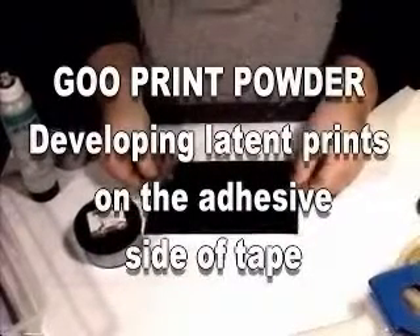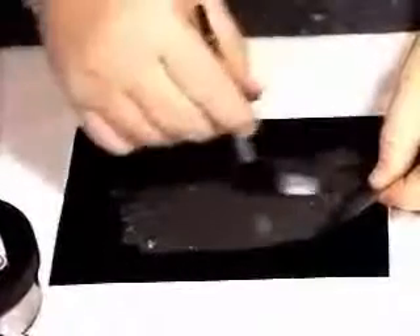When you have latent prints on the adhesive side of tape, a simple process is to use goo print powder. Take and spread the powder, which has been properly mixed, onto the taped surface, and allow it to remain on there approximately 15 seconds. This will allow time to adhere to the latent prints.